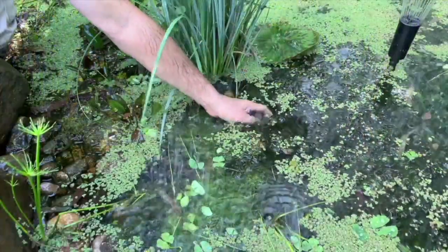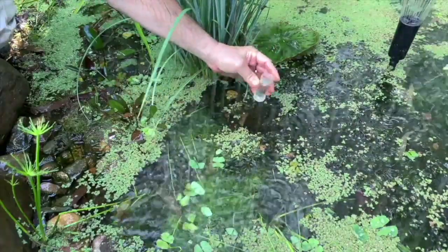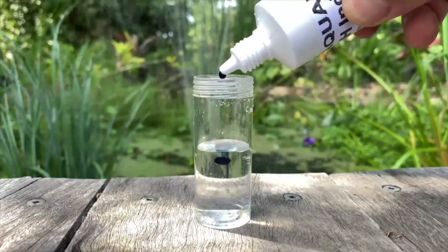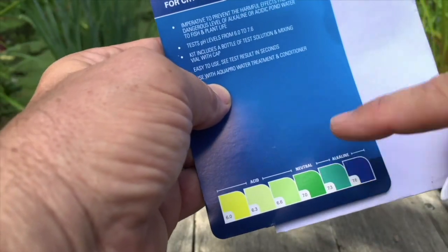So how do you use it? Make sure your test bottle is clean and take a sample of water from your pond, preferably from about mid-depth. With the bottle half full, add three drops of the indicator liquid, put the lid on and shake until mixed and colour is consistent. Now compare the colour against the indicator card to find where your water is sitting.